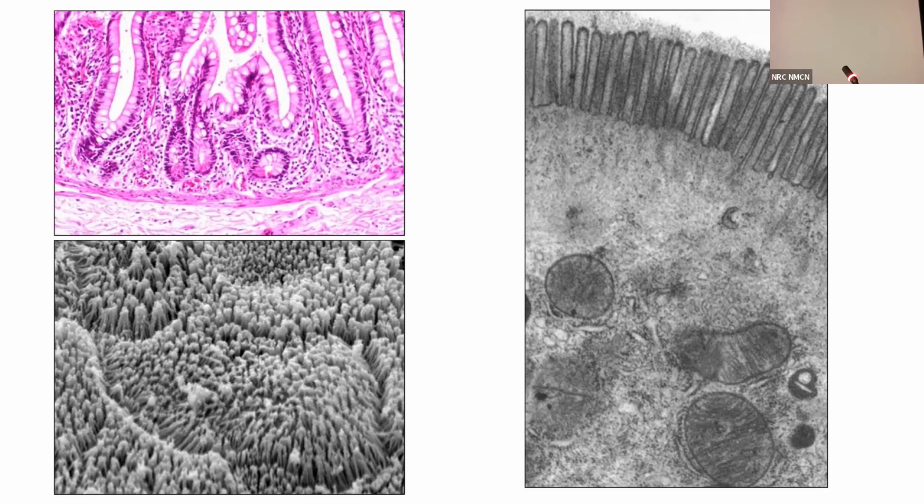But when we are looking at the transmission electron microscope, we will embed this tissue, that section, and then see that is a transmission. Why is it known as transmission? Because the image is formed by the transmission of the electron.